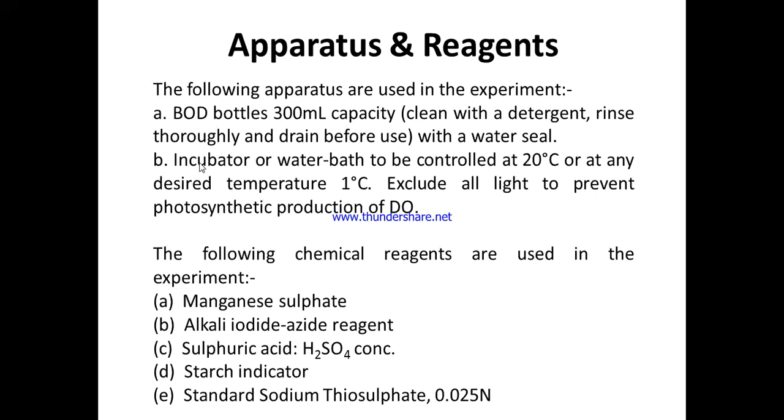Okay, we will also require burettes, pipettes. We will need a burette because in the burette we will do titration. Okay, then we will need a pipette because we have to pipette fixed required quantities of reagents to add in the water sample.